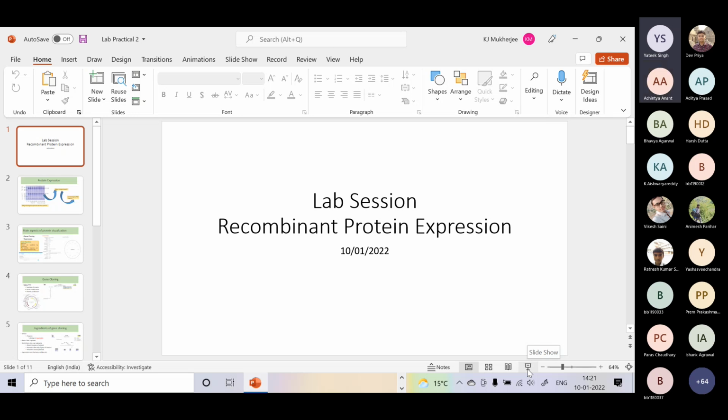Okay, so there are options like P blast and nucleotide blast. These are BLAST software. They are used for many types of work you can do. First of all, BLAST is actually an advanced version.